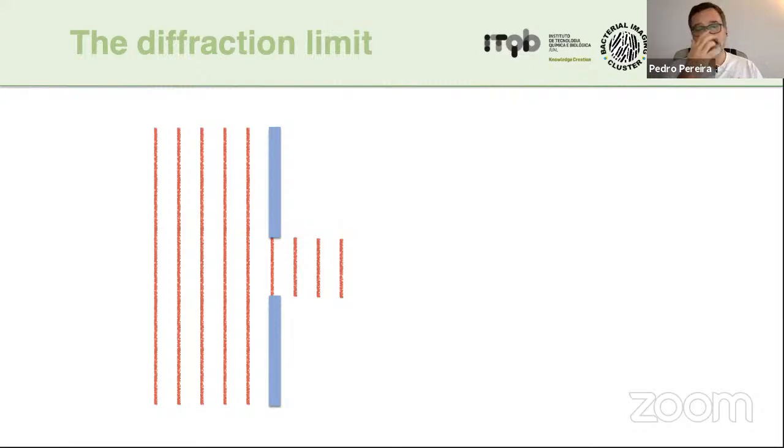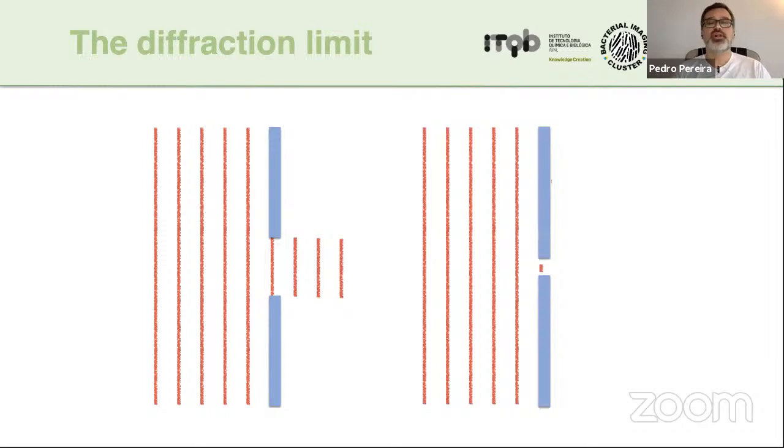So what is the diffraction limit? You all have seen, because you are alive in the world, light go through a hole, let's say a window, a door, and usually you don't see anything funny. You just see sunlight coming through your window and illuminating your living room, for example. However, let's now imagine that your window is extremely small, a tiny, tiny window. One could think that, okay, if I reduce the size of this hole, I'll just have less light going through. So it will be a straight line going through.